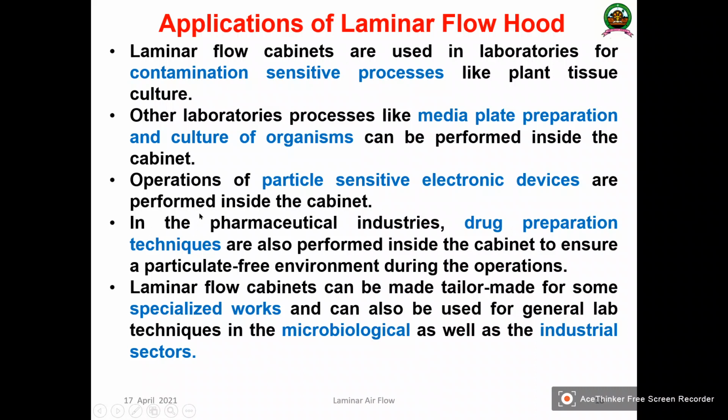Whatever sterile work we are doing inside the laboratory should be done in the laminar airflow. All the practical work you are doing on the workbench can be done inside the laminar airflow. The laminar flow cabinet can be made tailor-made for some specialized work and can also be used in general laboratory techniques, both microbiological as well as industrial, especially in industrial microbiology: fermentation technique, scaling up the microbial inoculum, and screening the microorganism. All those things can be done inside the laminar airflow.